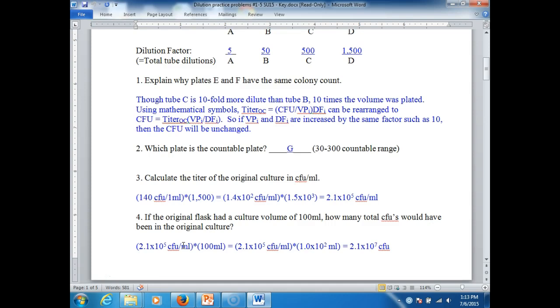Not always. So our numbers sometimes will err on the low side or the high side. What do you think? So if a single cell gave rise to that colony, our numbers would be accurate. What's another possibility? Not one cell, but 2 or 3. So our numbers would actually be on the low side, right? You wouldn't take into account those extra ones that were there. So that's another reason why we write CFU and not cells, right? So colony forming units. So there's about 2.1 times 10 to the 7th CFUs in that 100 mil volume that they started with in this example.